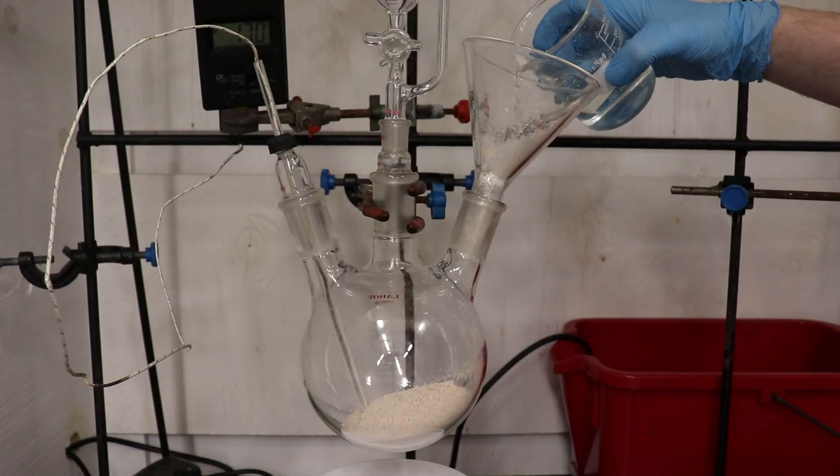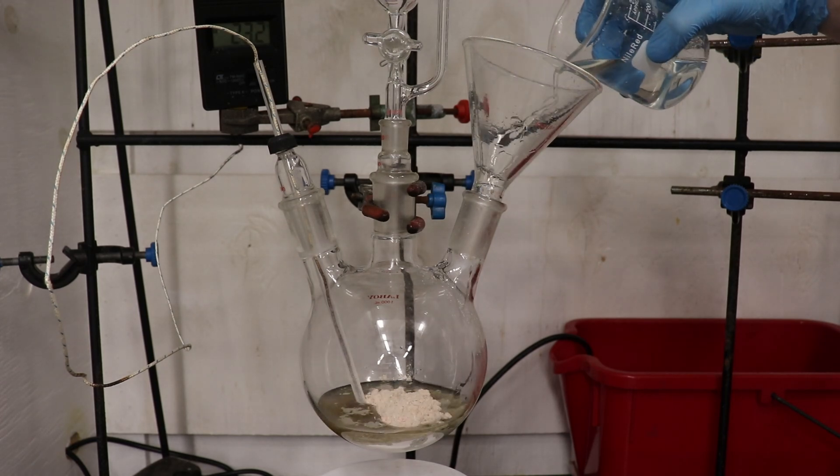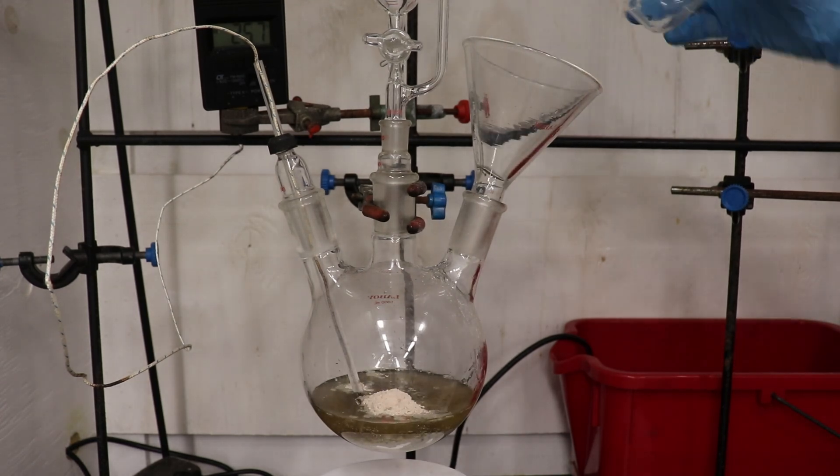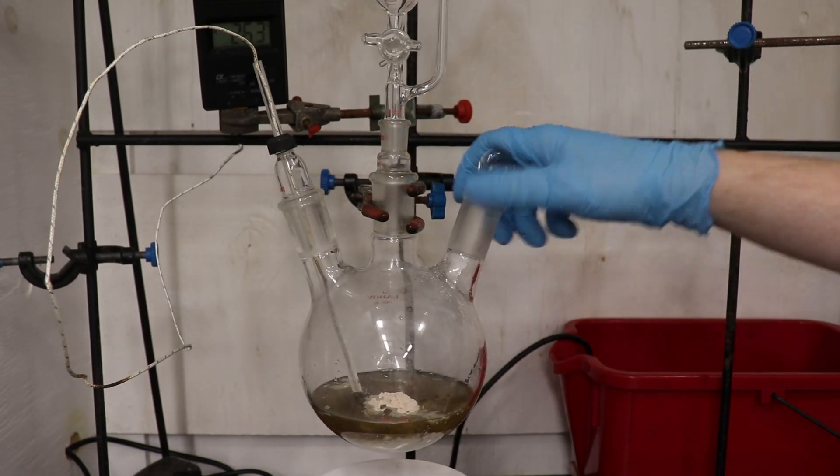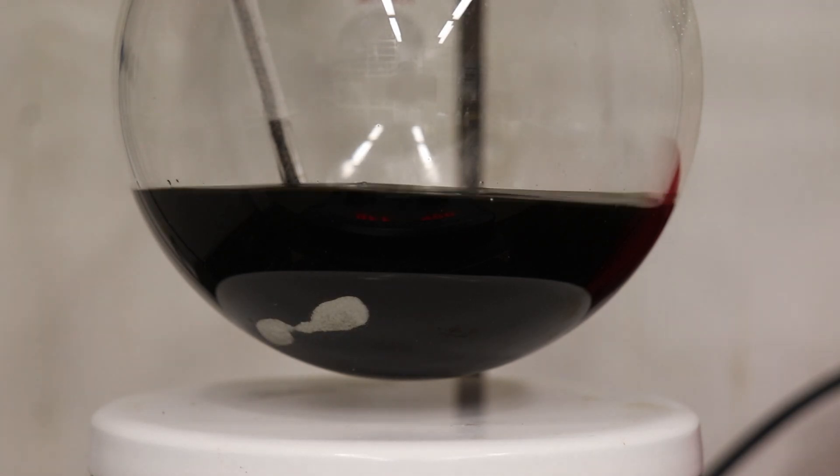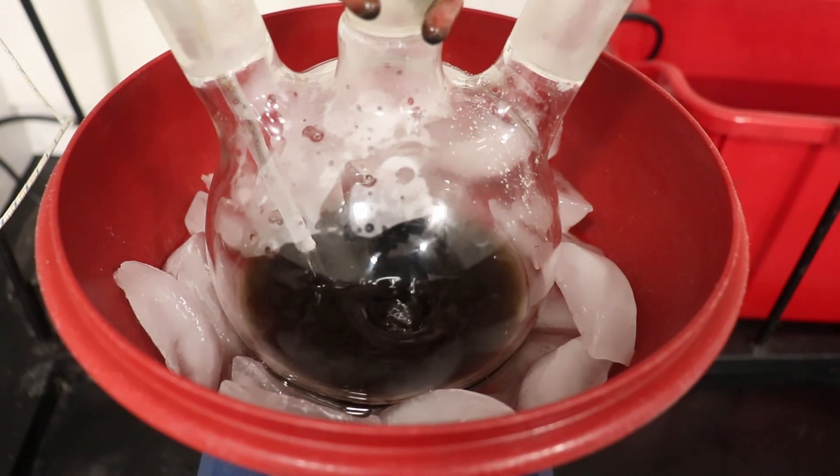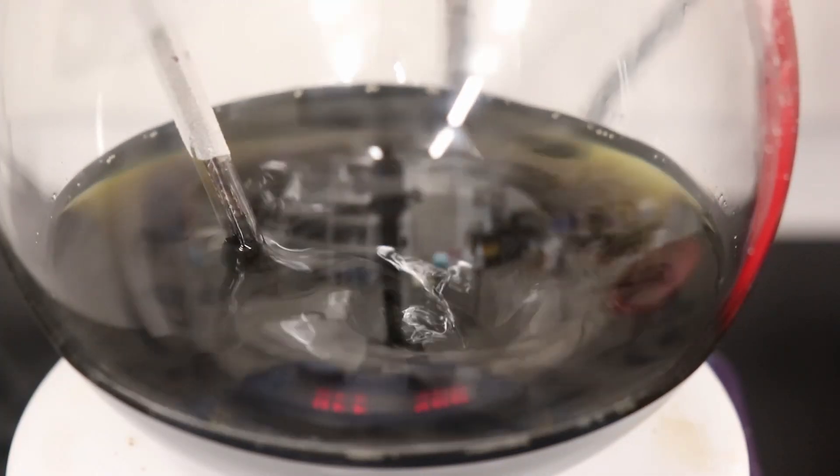The base solution was used to rinse out residual 2-napthol and poured into the flask. The 2-napthol dissolves in the base solution as the phenolic hydroxyl group is deprotonated by the sodium hydroxide forming sodium naphthalate, which is soluble in water. The darkening of the solution is due to the oxidation of the 2-napthol in air forming colored byproducts.